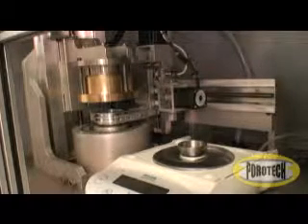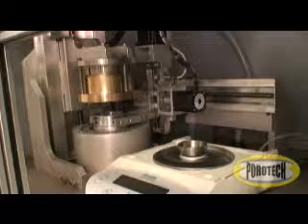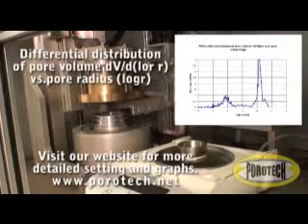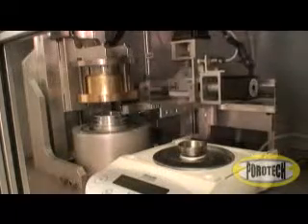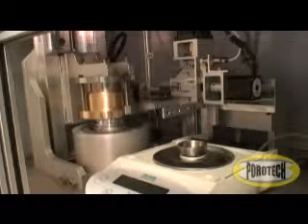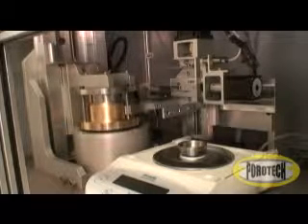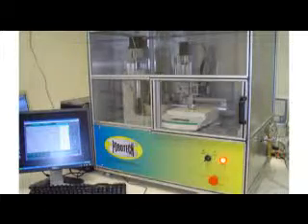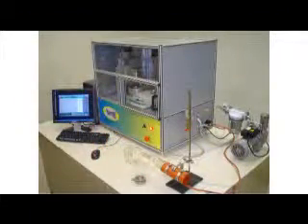At the end of testing, we will receive comprehensive numerical results that can be transferred to create integral, differential programs, and other data that will answer numerous questions about the characteristics of the pore structure of this material. The method of standard porosimetry and this unique equipment can test virtually all materials, including powders, soft frail materials, and materials prone to amalgamation. The ability to test in realistic environmental conditions using liquid, temperature, and compression will give you a competitive advantage in your materials research and product development.